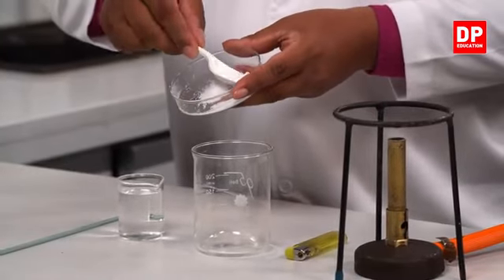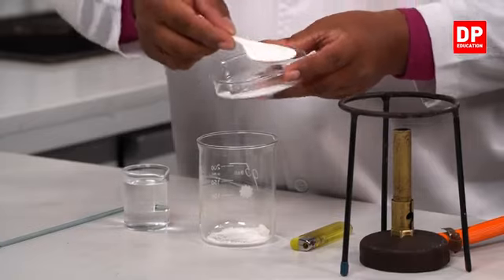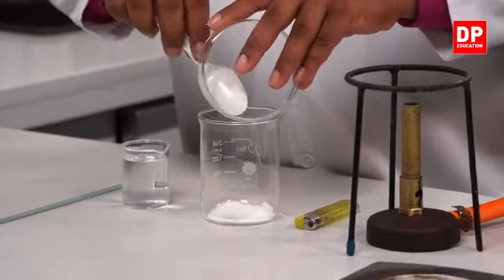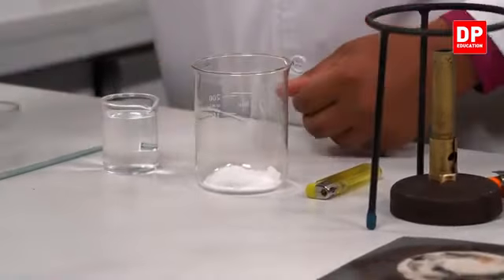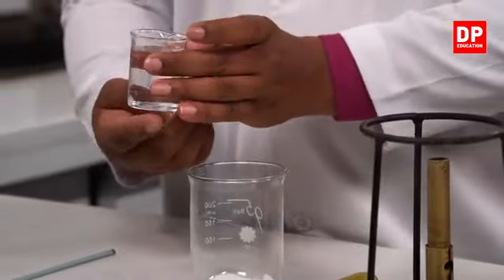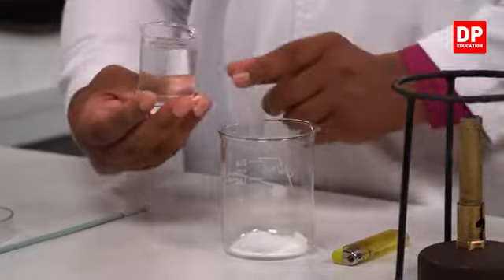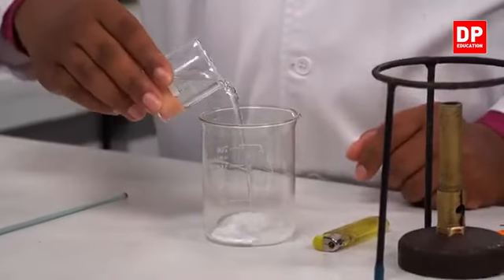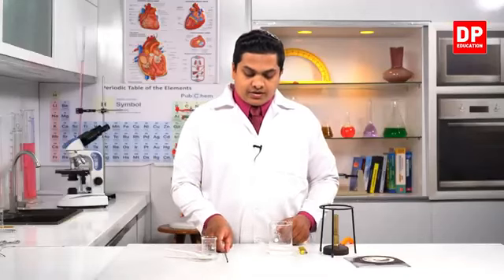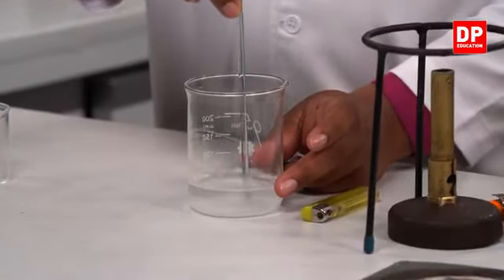Now I'm going to take a small amount of salt and put it into the beaker like this, and now I am going to add 50 milliliters of water to the beaker. So let's add water. And I'm going to take the glass rod and stir it very well to dissolve all the salt in it.